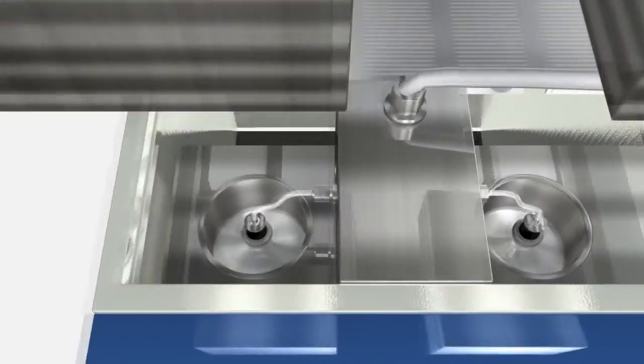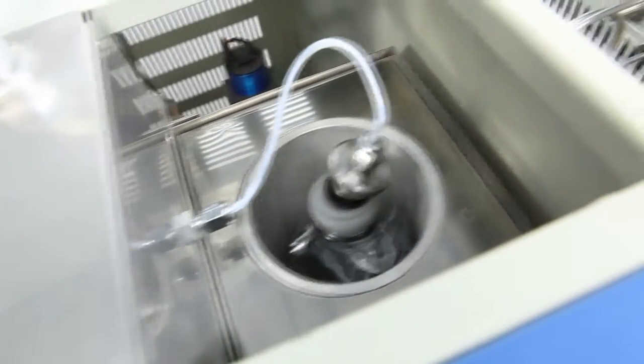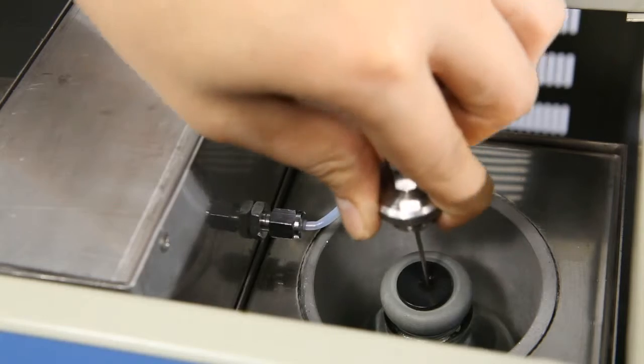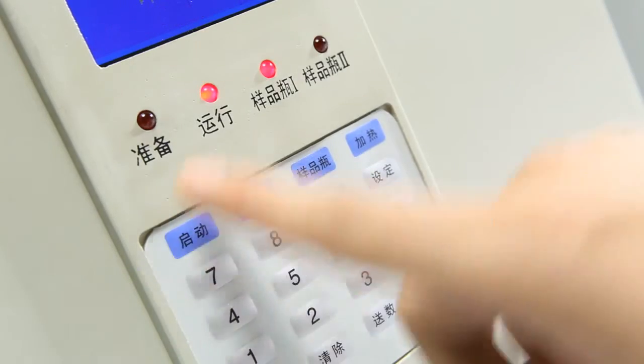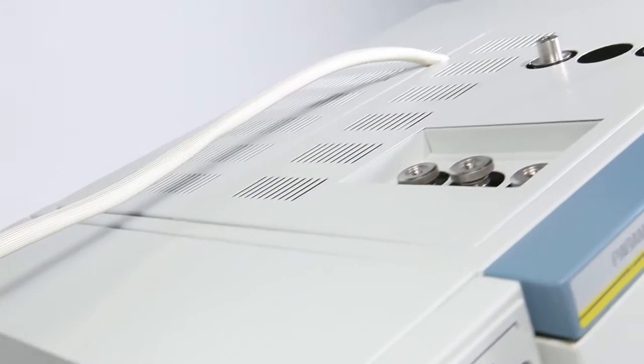This device can perform automatic sample injection and testing of two different samples in a predetermined order. Users only need to insert the sampling needle into the headspace bottle and press start. The system will then accomplish the sample injection and analysis automatically.